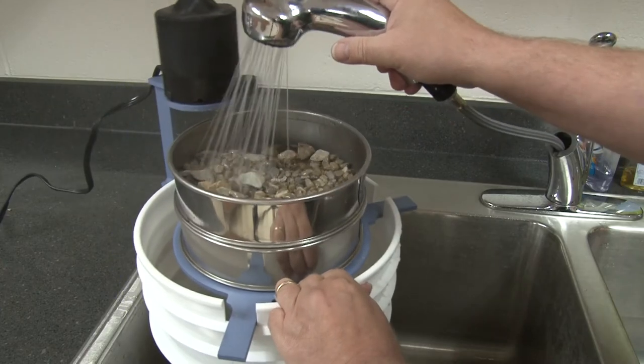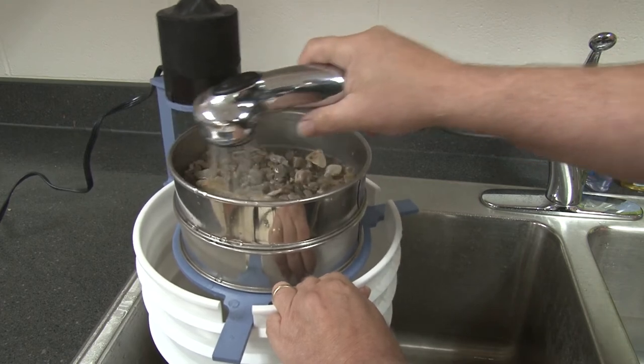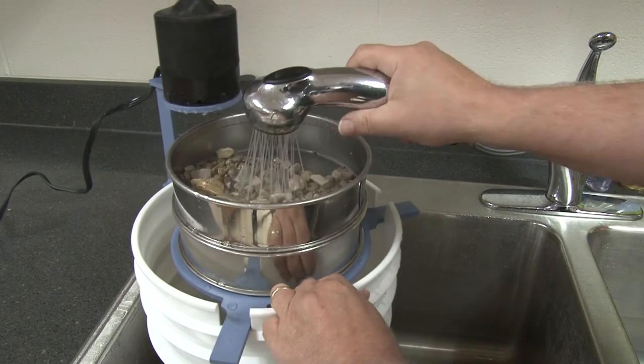And for wet samples, place the unit over the sink without a pan and gently introduce water to the sample until undersized material has been eliminated.